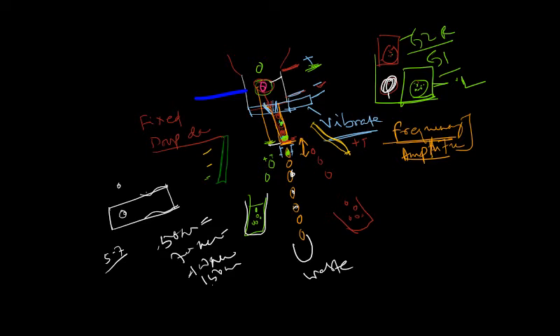This pressure affects how the stream breakup is going to happen. If we have a high pressure with a large bore nozzle, it would be very difficult to obtain a stable stream breakup. In the same way, if the pressure is too low, we will not be able to attain a stable stream breakup.